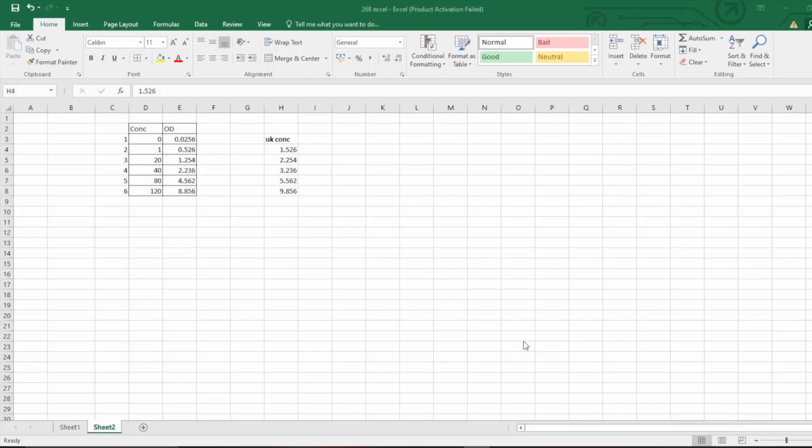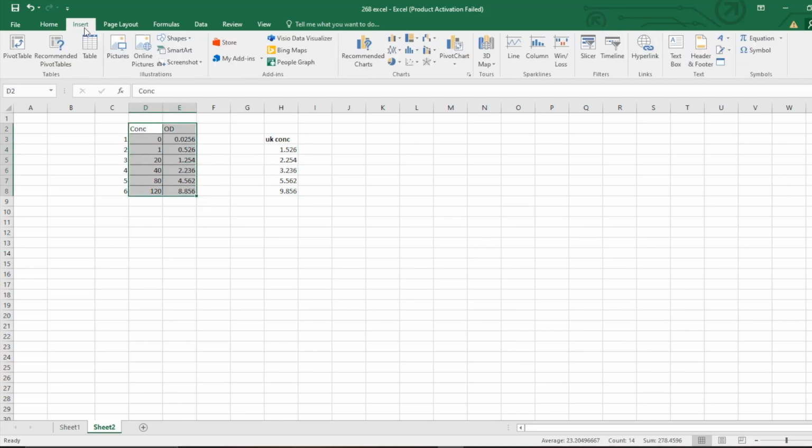Hey guys, welcome back. In this video, let's see how to calculate the concentration of an unknown from the standard graph, usually done for ELISAs for scientific work. So here we have concentration and OD. Just go to insert a scatter plot first.